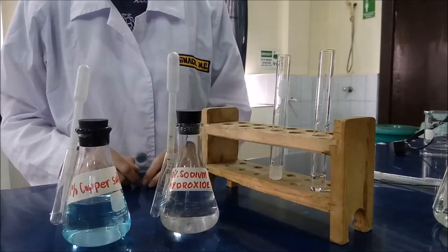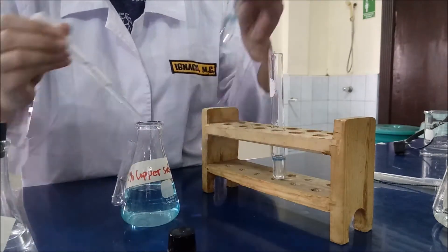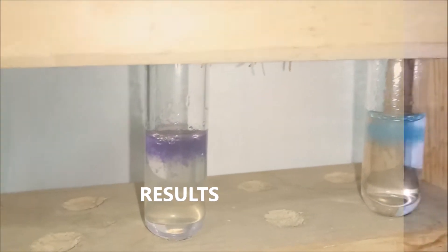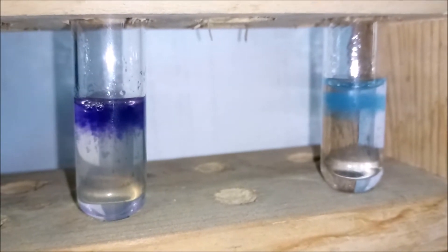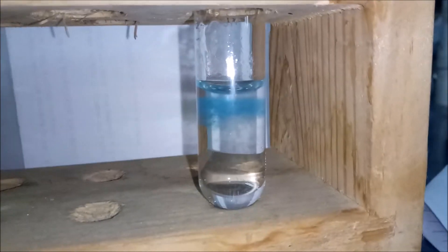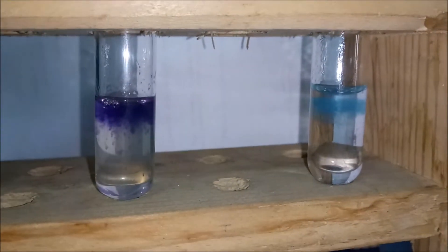Next is to add 1 ml of 10% sodium hydroxide and about 5 drops of 1% copper sulfate. This test tube contains the 5% albumin while this test tube contains the urea. As we can see, the test tube that contains albumin suddenly turns to violet color on the top layer of the solution, while the test tube that contains urea suddenly turns to light blue color, both on the top layer of the solution.